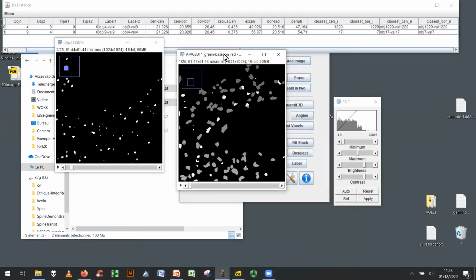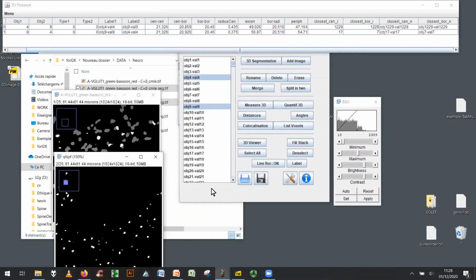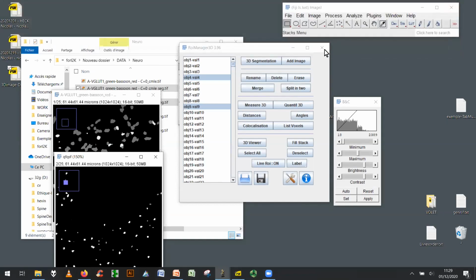So it's almost 11:30 Paris time. So let's say we have 30 minutes left. So maybe we can take some questions, and then I'm sure we have a lot more to say. But maybe if you have one question, we can focus on one specific topic or something we didn't explain properly, or you have a question about a specific measurement or specific plugin. Yeah, so please.